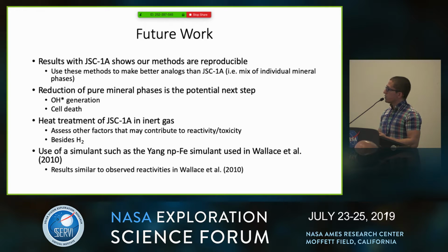Something we also want to do is see what effect heat treatment alone has on these samples besides just the reduction. So let's remove the H2 and add something like argon, and see how the reactivity and toxicity might change with just heat treatment alone.